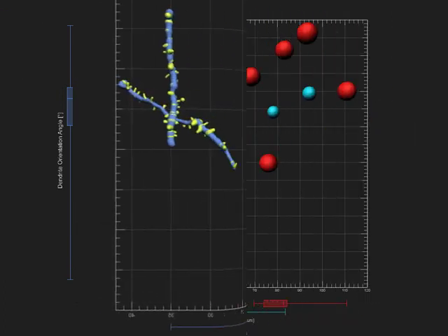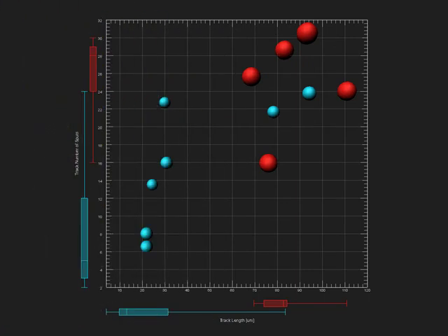The simplicity of the box plot makes it ideal to analyze and compare results of multiple samples at once. If a Vantage plot is composed of multiple objects, a separate box for each dataset is created in the viewing area. Plot boxes are displayed side by side.